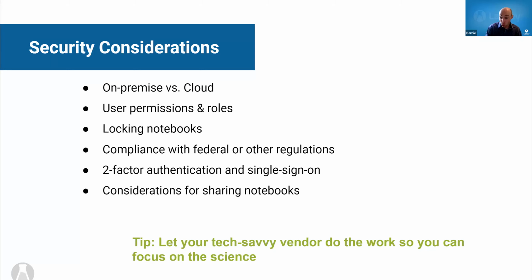It's going to be really important that all of these things that you need to comply with, make sure that the software that you're using allows you to comply with them. There are a variety of features that support this stuff. For example, version control, edit history, authentication, required signatures, detailed auditing of all actions in the system, and many, many more. Let vendors show you how they help you comply with these things.